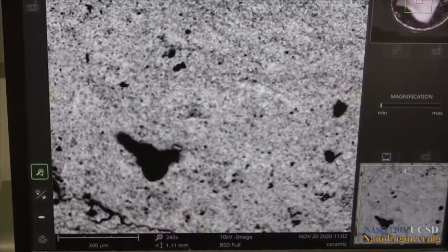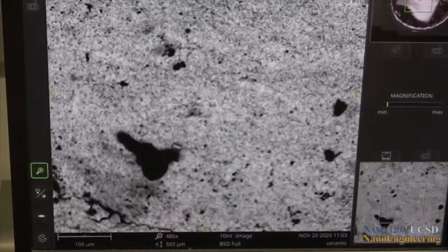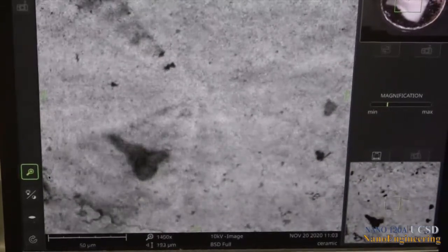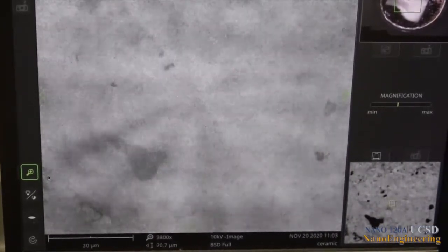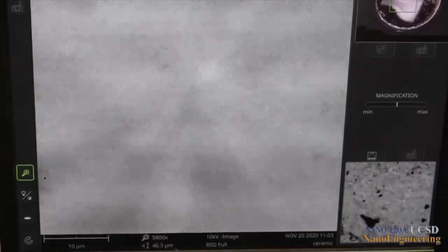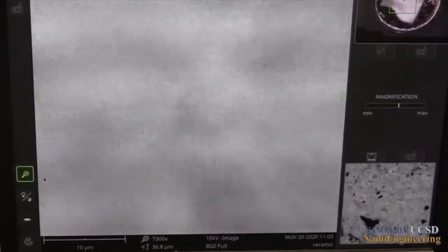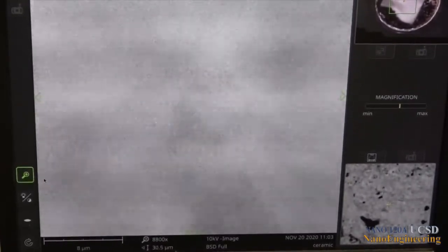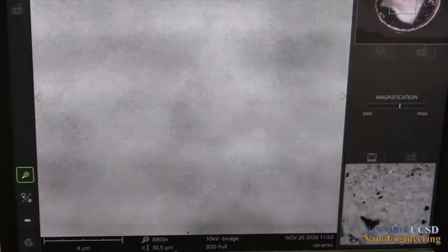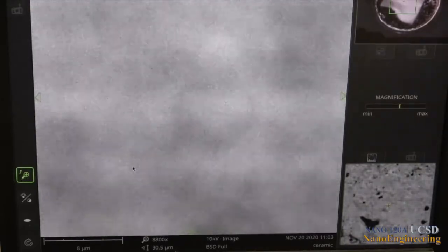Click on the magnifying glass icon and turn the dial to take the magnification higher. We will use 8000X for this demonstration. The magnification status can be followed on the bottom of the screen. To attain the exact magnification we seek, click on the magnifying glass icon again until the F appears to adjust the magnification in finer increments until you dial in the desired value.